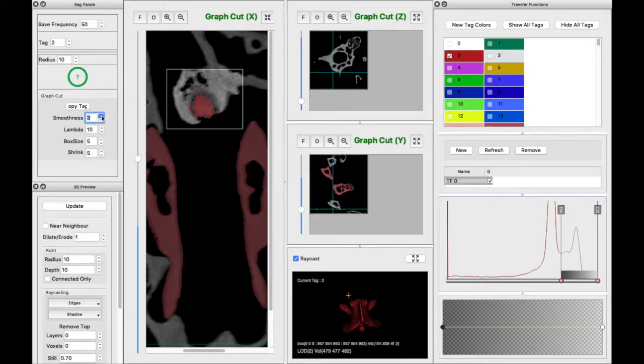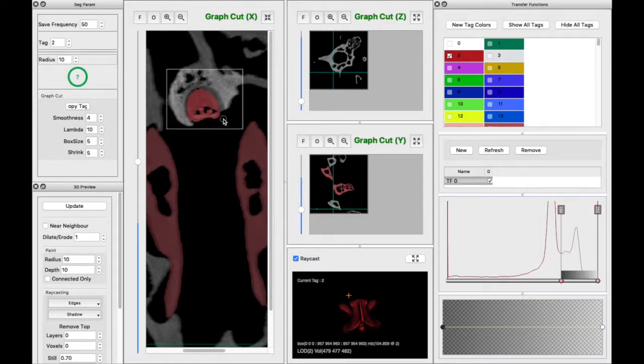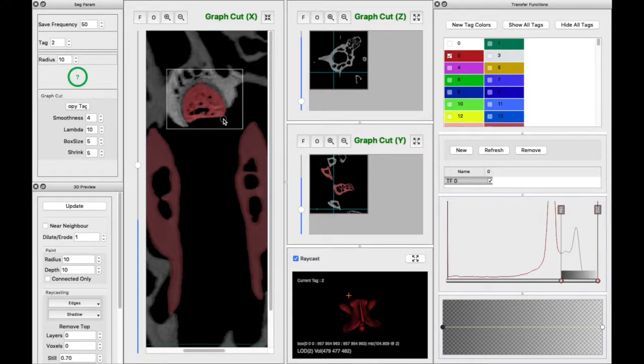Let's try 3, how about, or 4. Okay, yeah, all right. Now we're cooking with oil. See, it's erasing all the straggler lines and just averaging them together, which will ultimately lead to an incredibly silky smooth surface of the condyle.